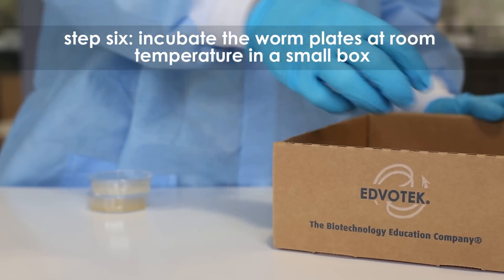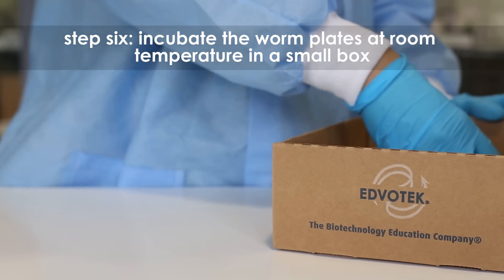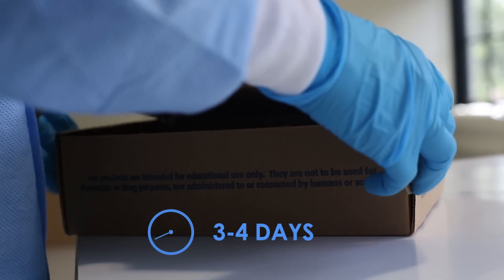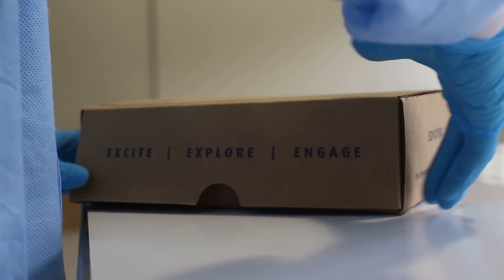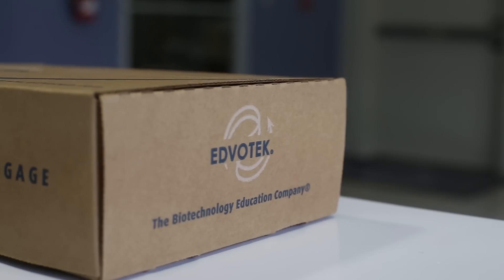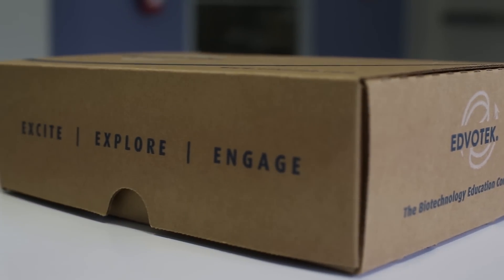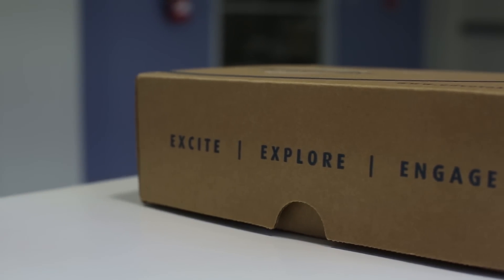Step 6: Place the worm plates inside a small box and incubate at room temperature for 3 to 4 days. If a plate contains 50 or more worms, proceed with the experiment. If a plate contains less than 50 worms, incubate for an additional 1 to 2 days.